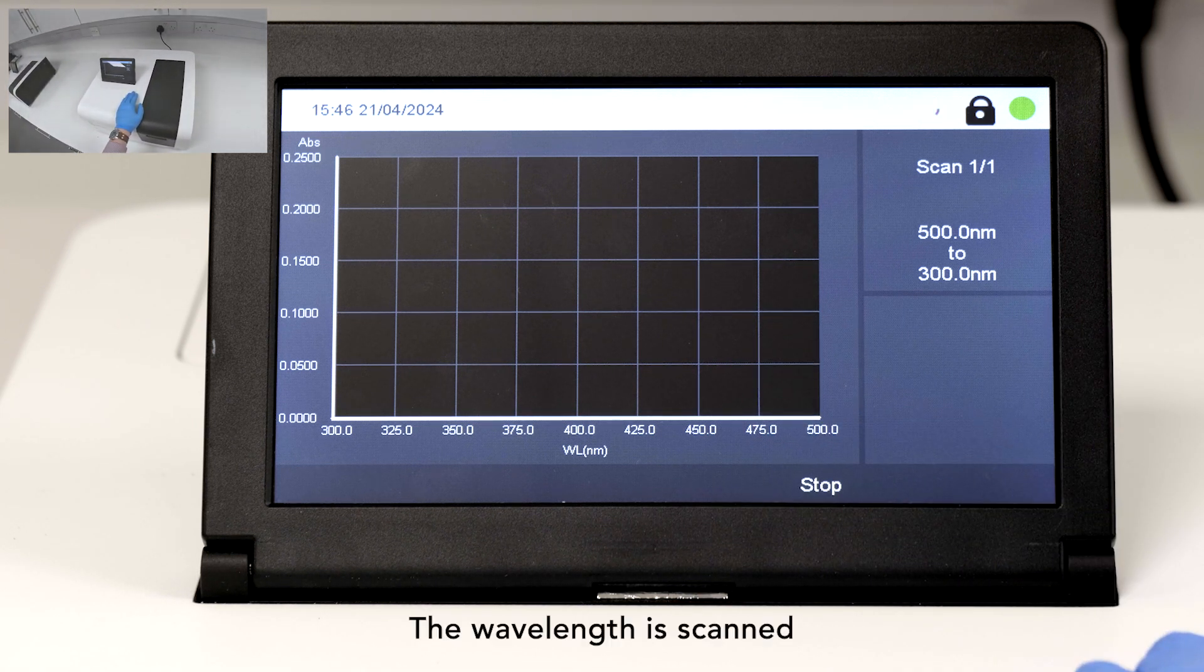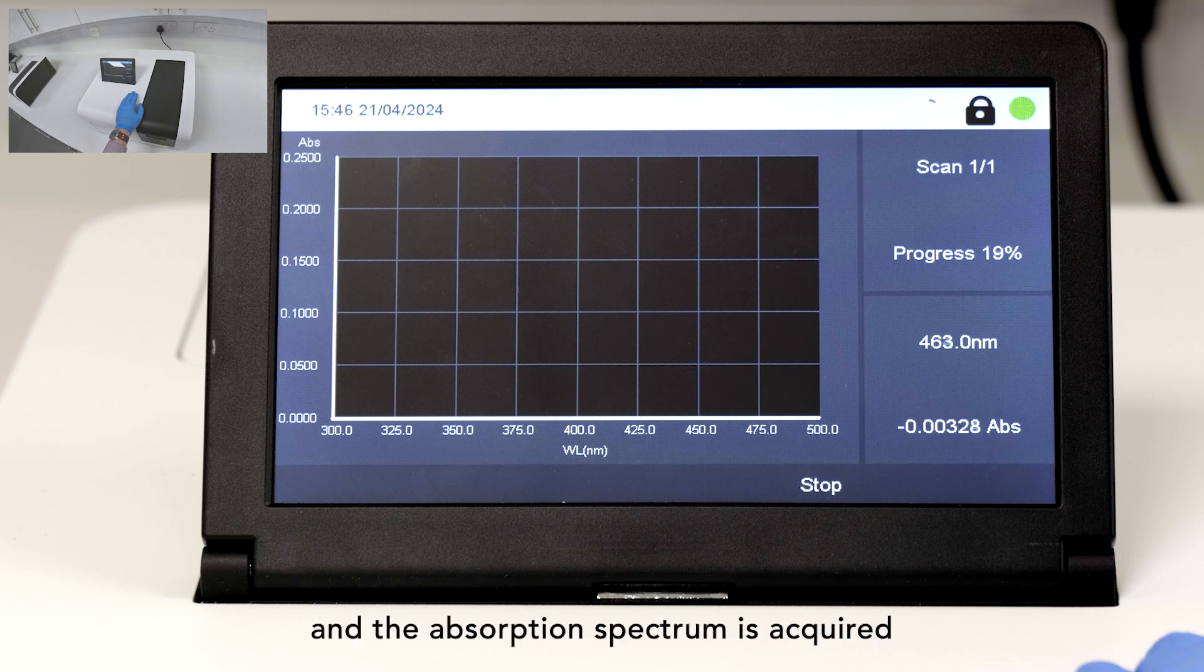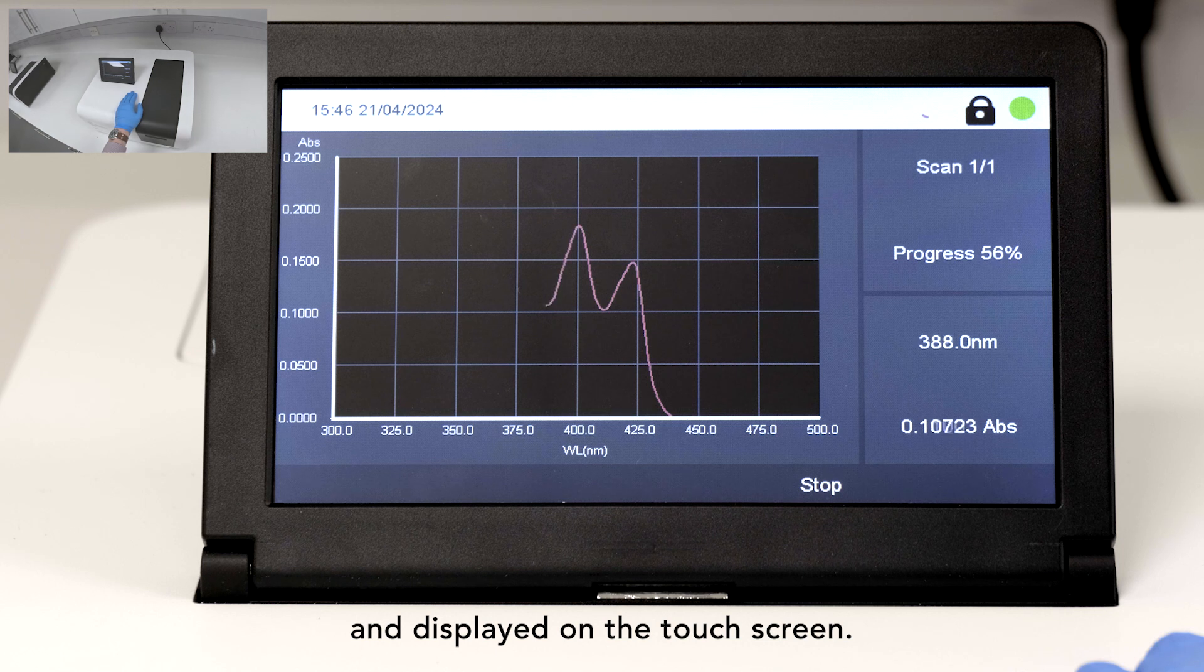The wavelength is scanned, and the absorption spectrum is acquired and displayed on the touch screen.